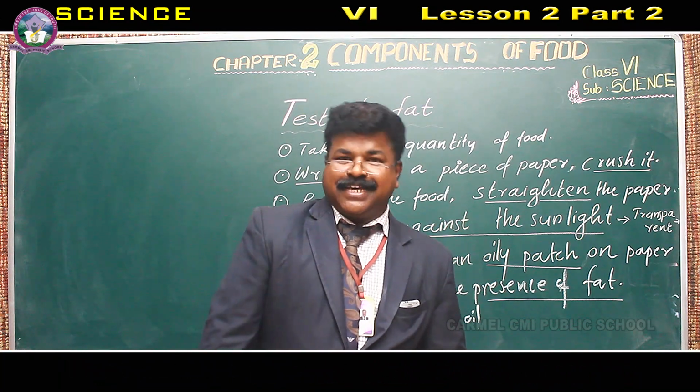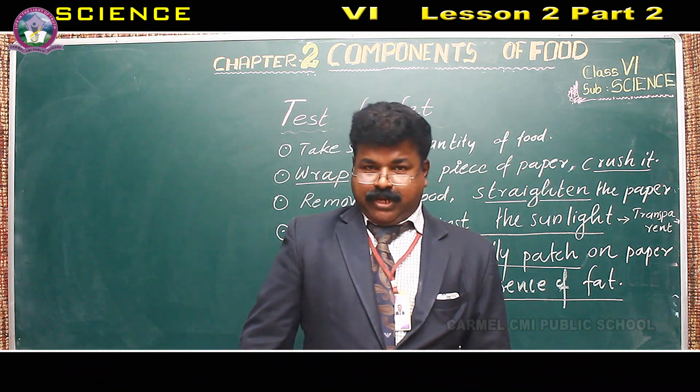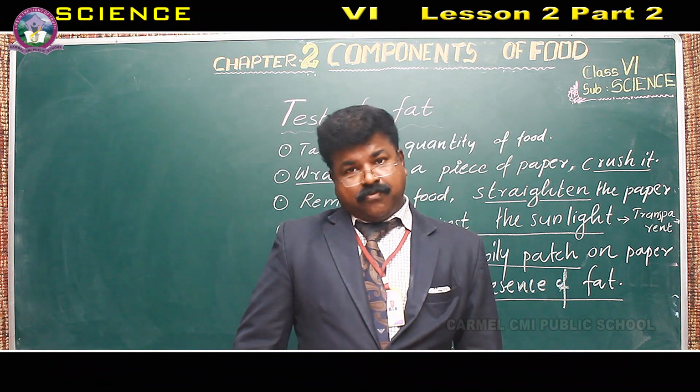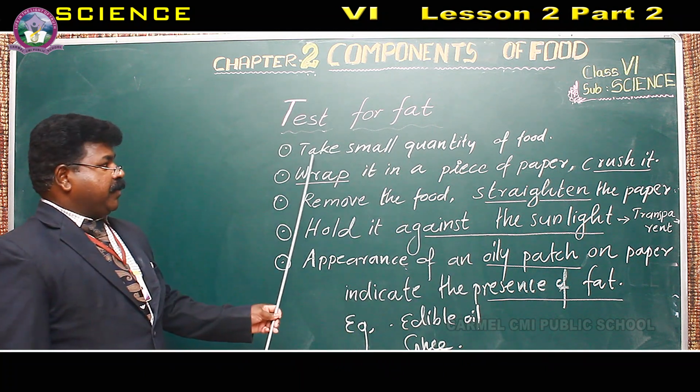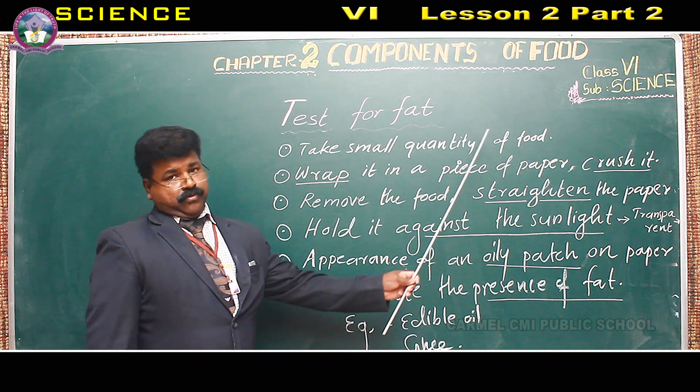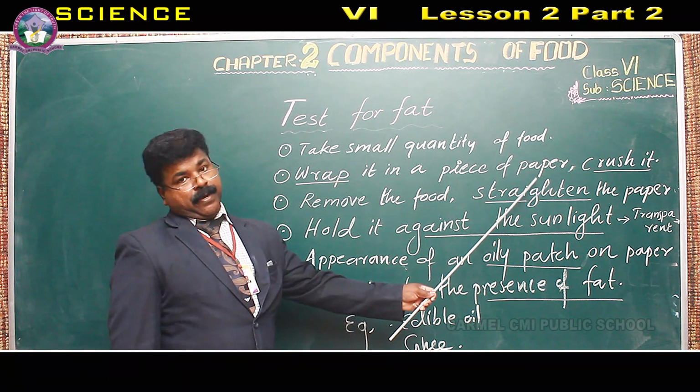Okay, students, we have already learned about the test for starch and protein. Now we are going to learn about the test for fat. Let us see how to do it. First of all, we need to take a small quantity of food. Then wrap the food item in a piece of paper.